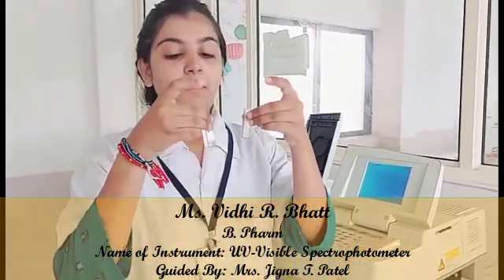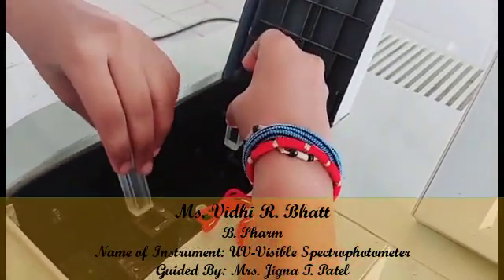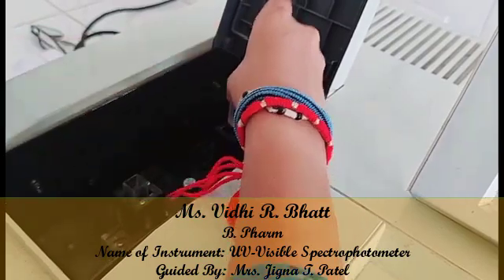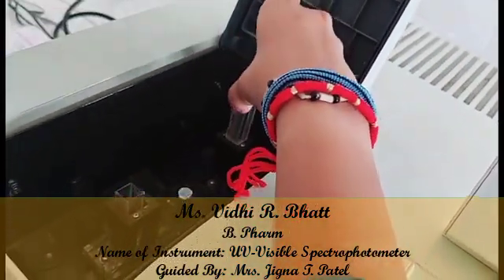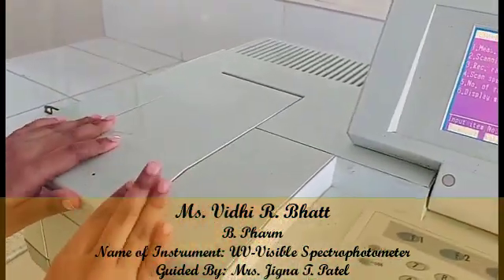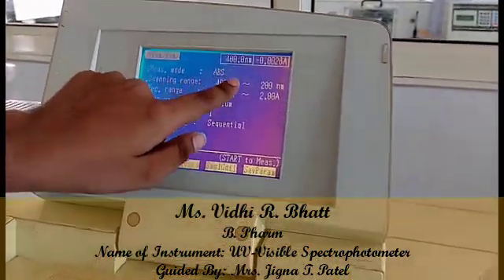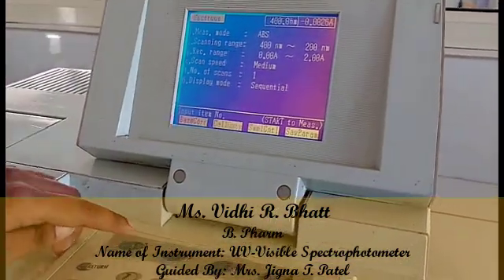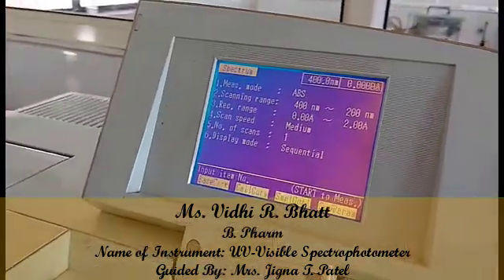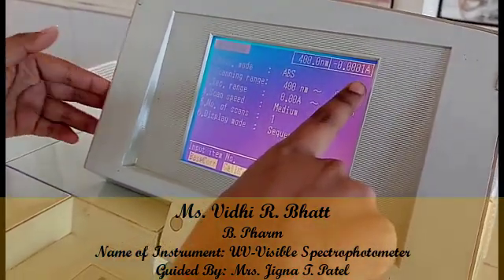We have filled both cuvettes with solution and will place them in the chambers — opaque surfaces facing towards us so that light passes through the transparent surfaces. We then press the F1 button for baseline correction. After correcting the baseline, we observe 0.00 absorbance.